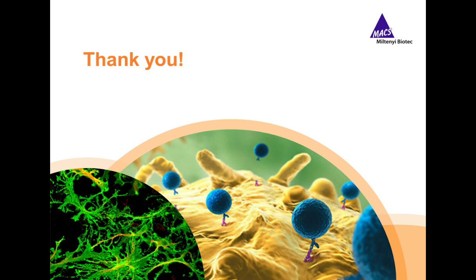Thank you. Can you isolate astrocytes from the hippocampus or cerebellum from one adult mouse? And if yes, how many cells can you acquire? Yes, that's possible. We have a special protocol for the dissociation of such small brain regions, and then it's also possible to separate the astrocytes by magnetic cell sorting.